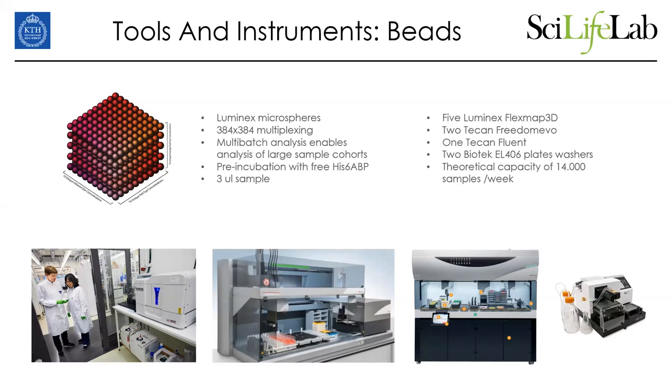amount. And today we have five Luminex FlexMap 3Ds. We also have them for liquid handling, both for the FlexMaps, of course, and also for the planar arrays. Two Tecan Freedom Evo and one Tecan Fluent and two plate washers from Biotech. And this gives us a theoretical capacity of about 14,000 samples per week.